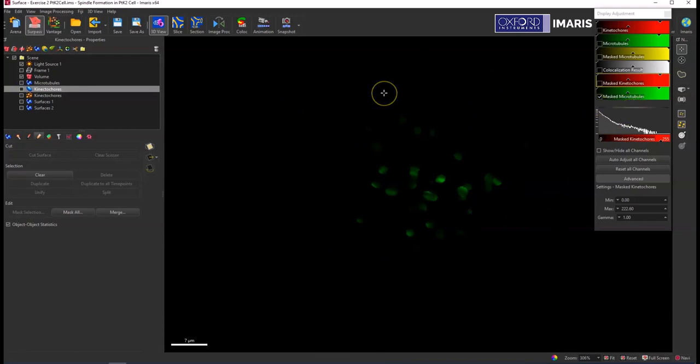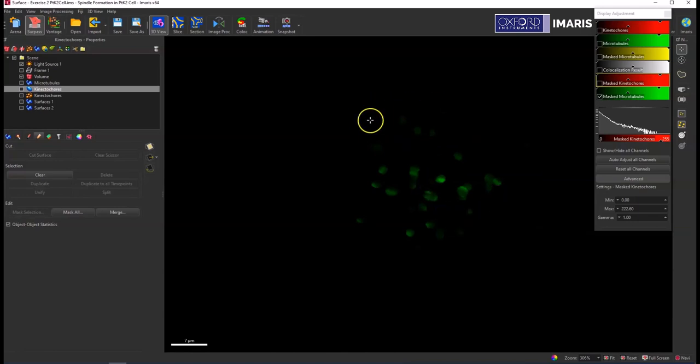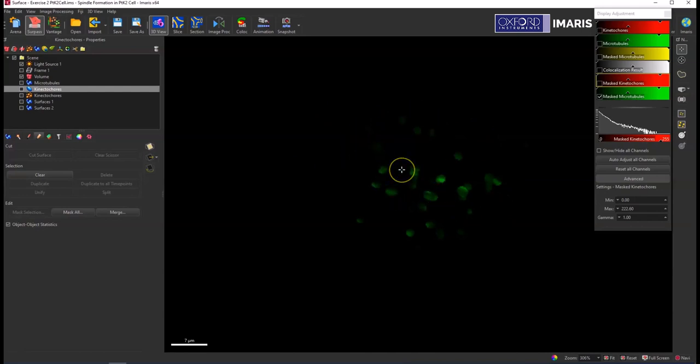So now I have this new mask channel that I can use as an input for surface creation or object detection in spots or any of the different modules. And you can also use it for statistical output too, because now in all the statistics there will be a new option for intensity measurements for any of these mask channels that are in the display adjustment window.